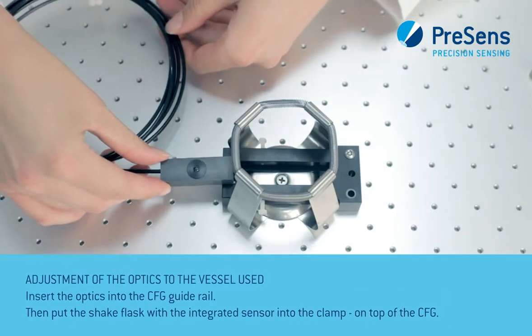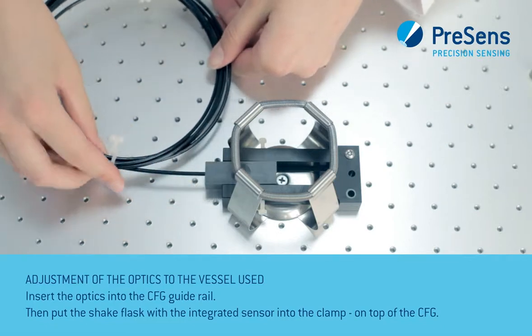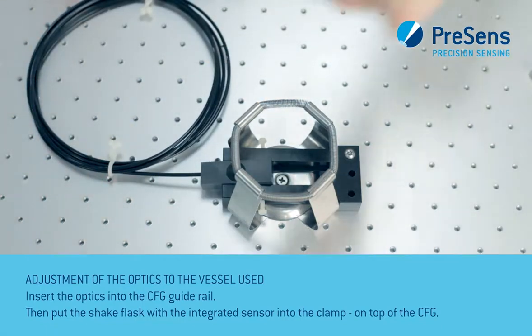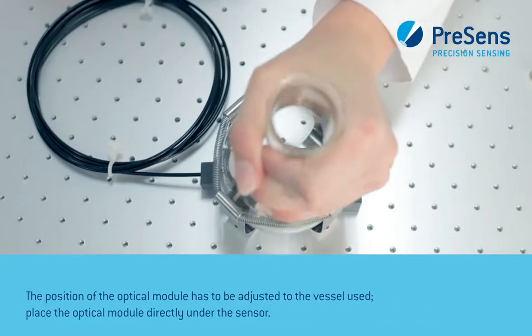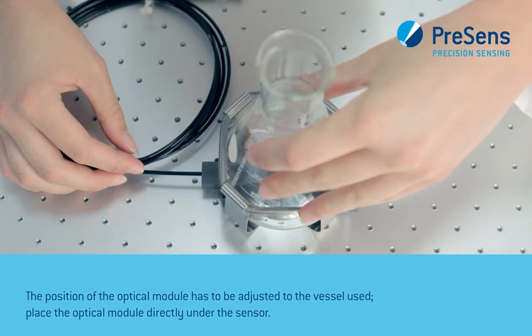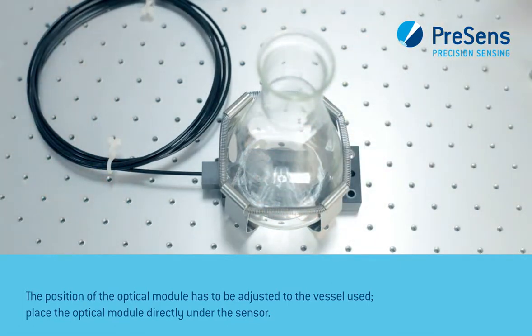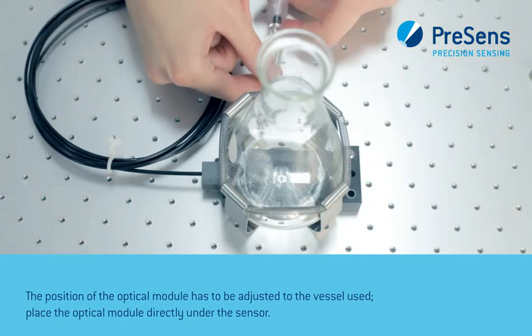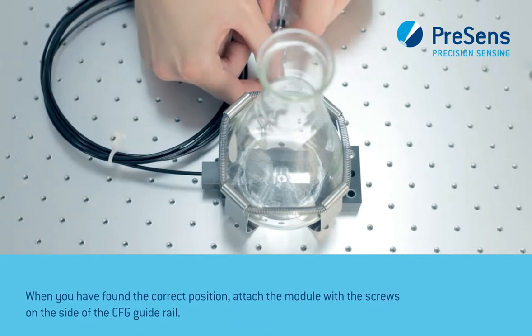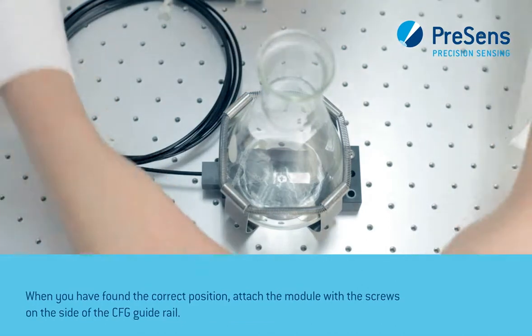Insert the optics into the CFG guide rail. Then put the shake flask with the integrated sensor into the clamp on top of the CFG. The position of the optical module has to be adjusted to the vessel used. Place the optical module directly under the sensor. When you have found the correct position, attach the module with the screws on the side of the CFG guide rail.